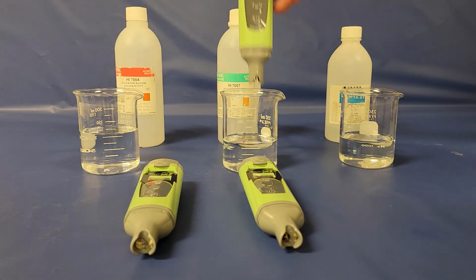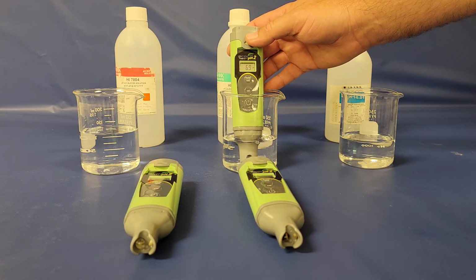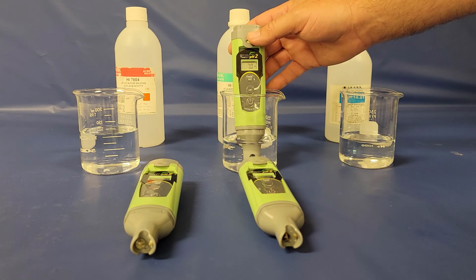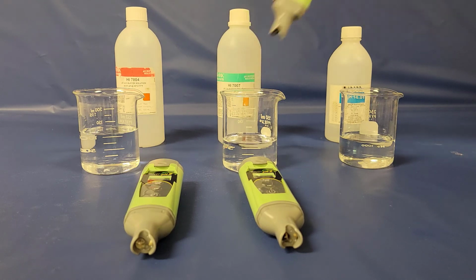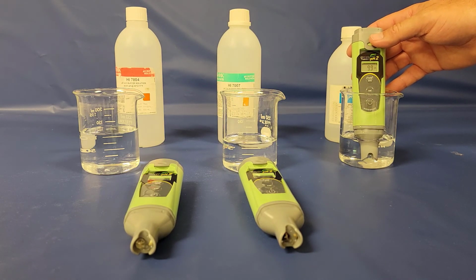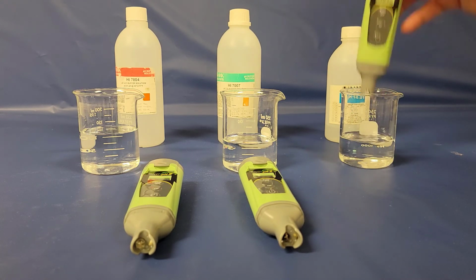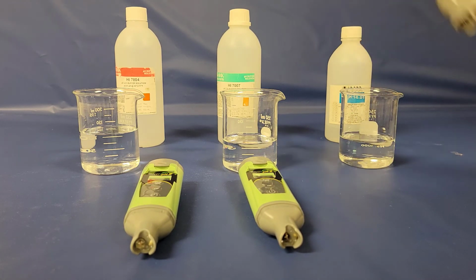Okay, let's go ahead and move it back to the 7. Now it's about 7 there. And then move it over to 10 here. So it looks like it's pretty close, but it's a little off. All right, so we're going to calibrate that particular unit.